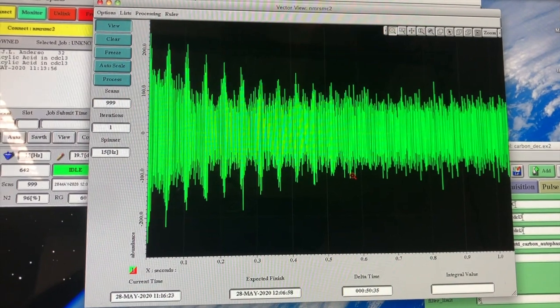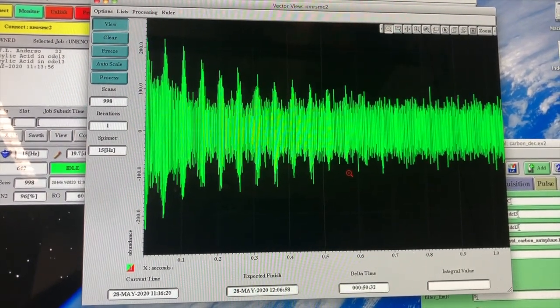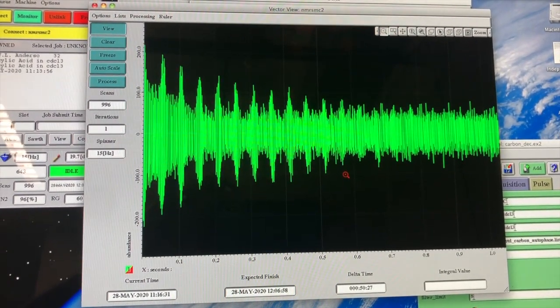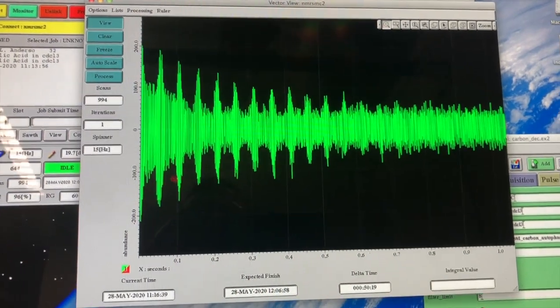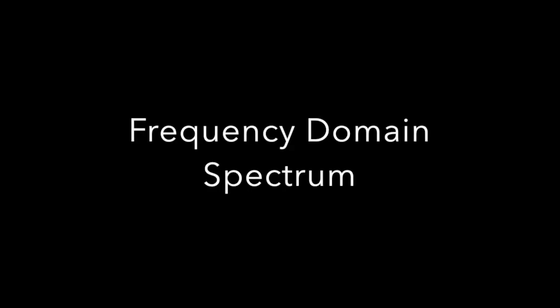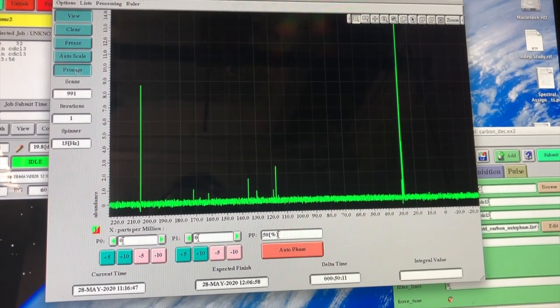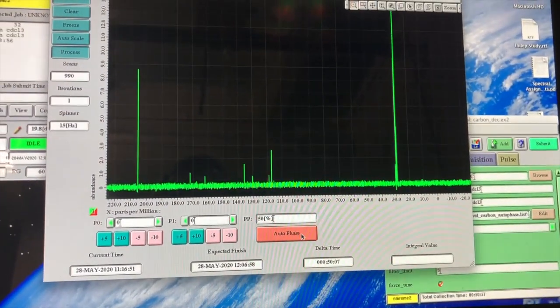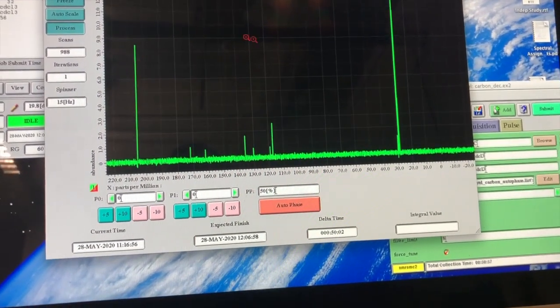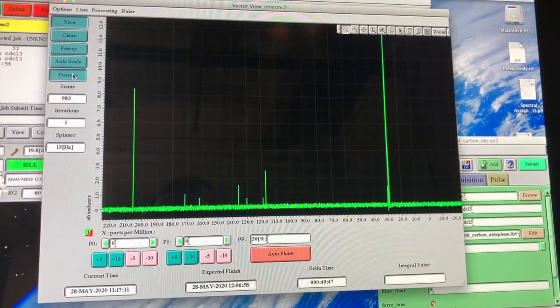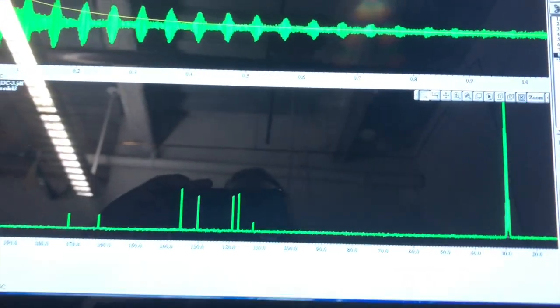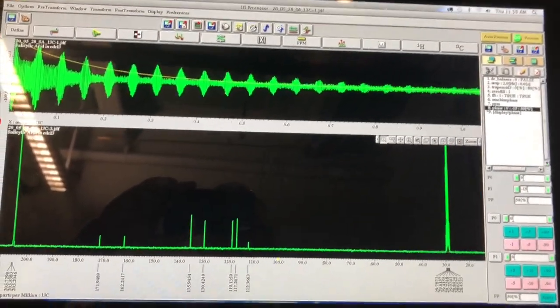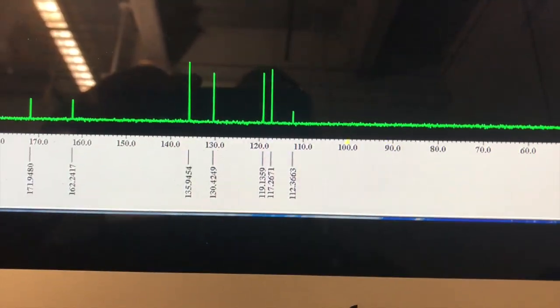Here you see the time domain magnetic resonance signal forming, where the x-axis is time and a complex wave pattern is formed. The frequencies of each one of our carbon-13 atoms in our sample is found in this pattern. We can then transform this pattern into a frequency domain where each one of the lines now represents a frequency of a specific carbon atom in our molecule. The two large lines on the outside represent the solvent peaks, as they too have carbon atoms in them. You can see that the peaks are getting taller and more visible as we scan the sample more and more. Eventually when the scans are complete it's time to process the data. You can see we are marking the frequency of each one of these peaks which represent the carbon atoms of salicylic acid.